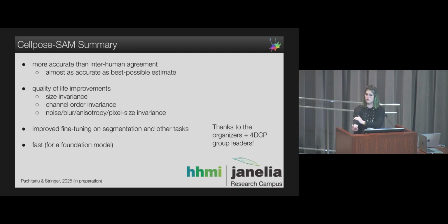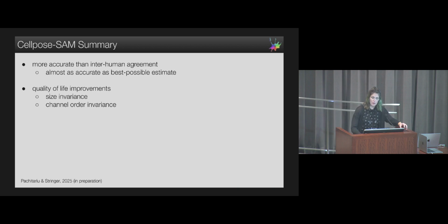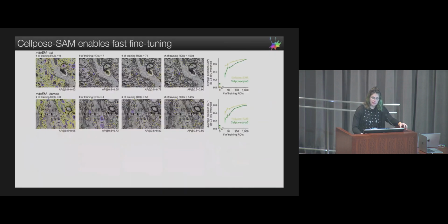All right, we have a question on Zoom from Samsara Upadhyaya. Really interesting. I'm wondering how the detection of debris works for Cellpose-SAM. Thanks. The detection of debris? Yes. I think it will depend on what the debris looks like. Ideally, I'm optimistic about it because it was really fast here to learn to ignore everything else, to go for just the mitochondria in these images. So I'm hopeful with a couple of images of debris, it shouldn't be too bad.